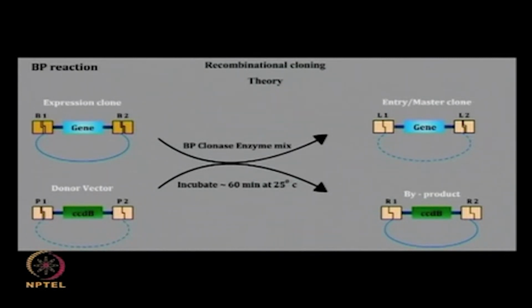The reaction is incubated for just an hour at 25 degrees centigrade to obtain the entry or master clones containing genes of interest.